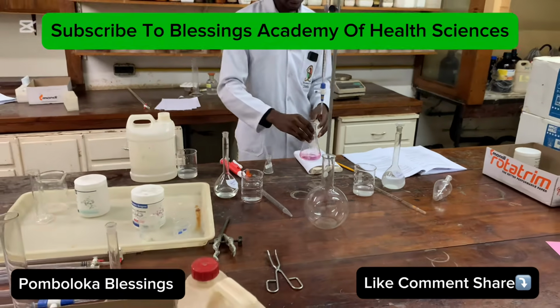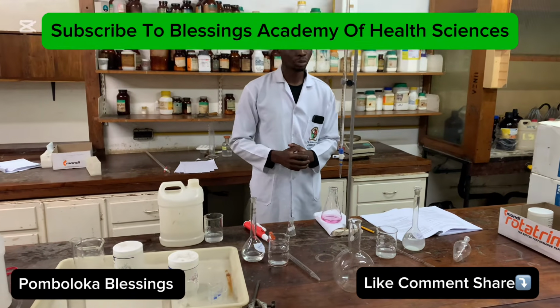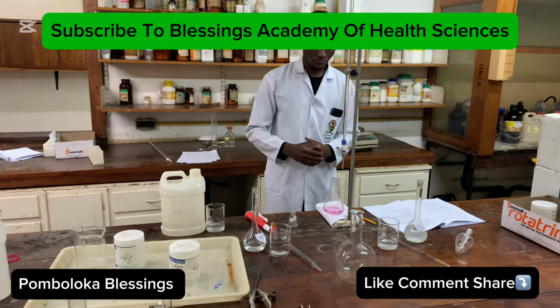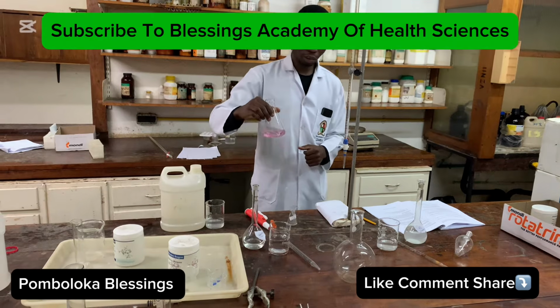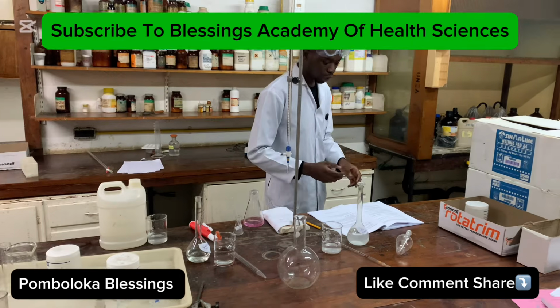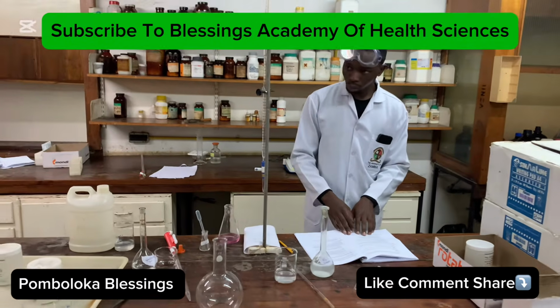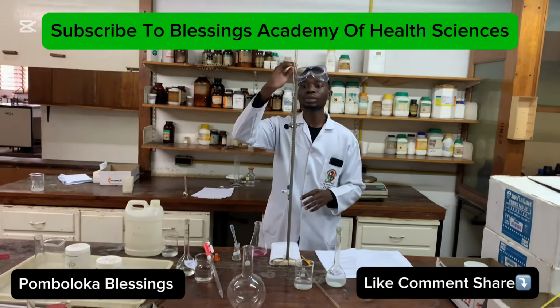All right, so you can see that we have titrated with the titrant, the sodium hydroxide, mixing with what we have in here. And then we have a change of color there. So this is the first titrant. And when you get back to your table, there is a table showing titration of HCl with 0.1 sodium hydroxide. So we have the first one here, you record. So we are starting from 0 there.